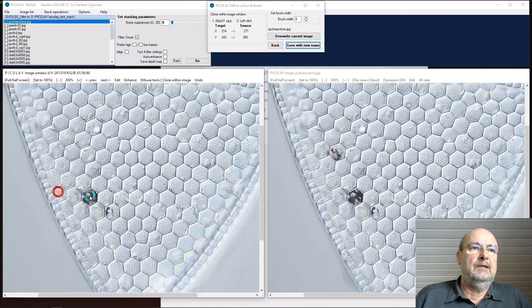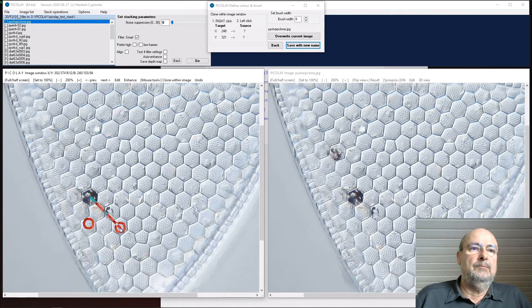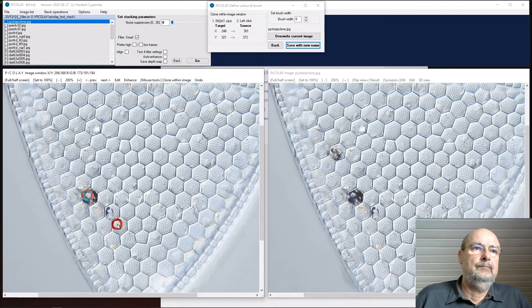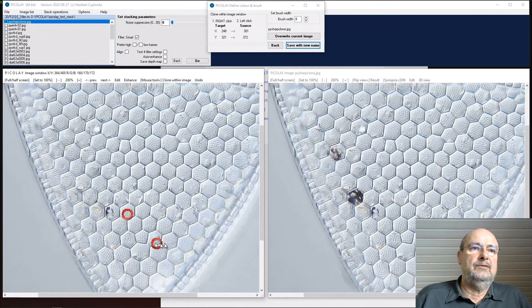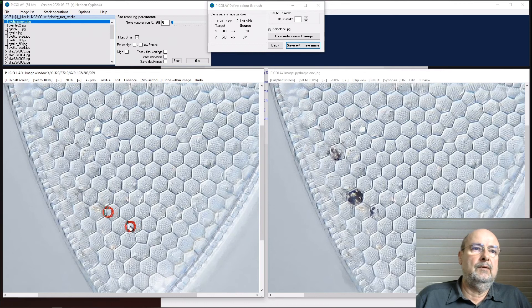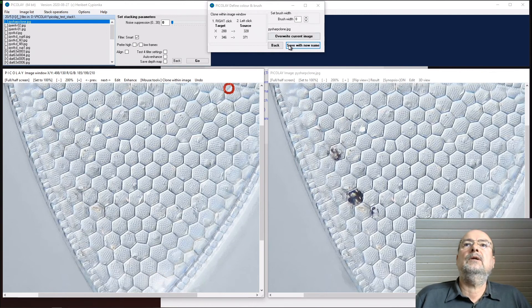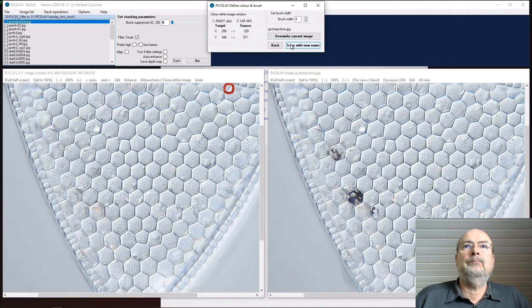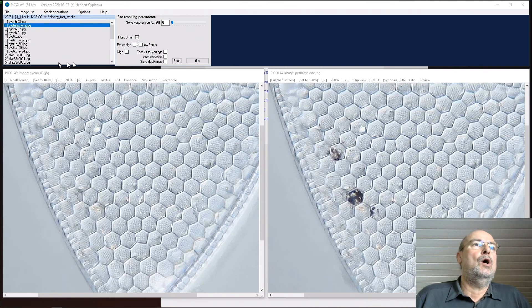Same thing here: right mouse button on this. This looks better. Left mouse button here and we go here and clean it. We could do this for more structures here and here again. That's it already. Save with new name.